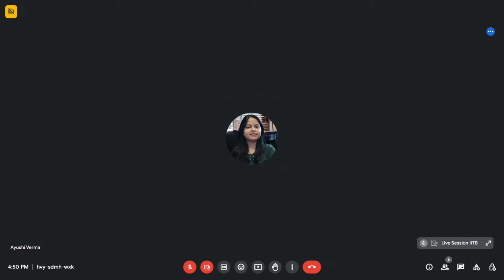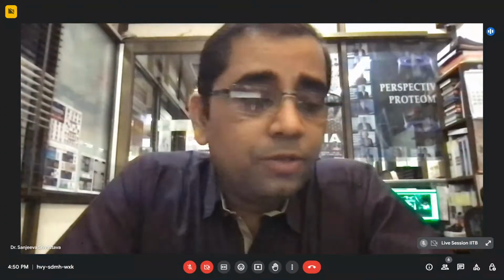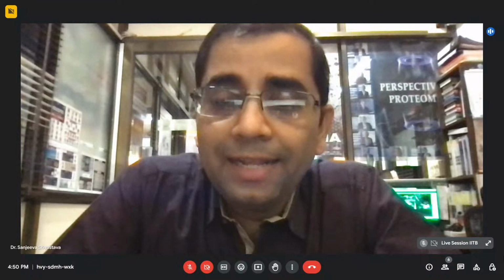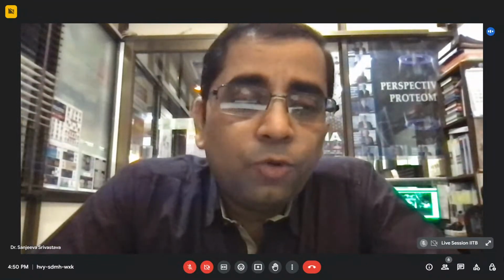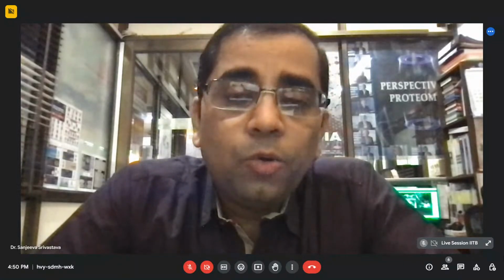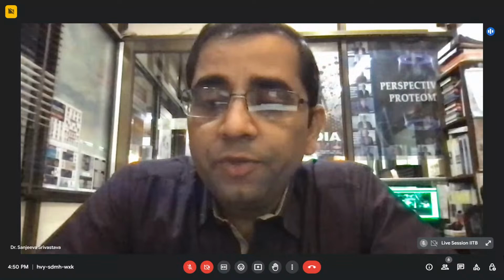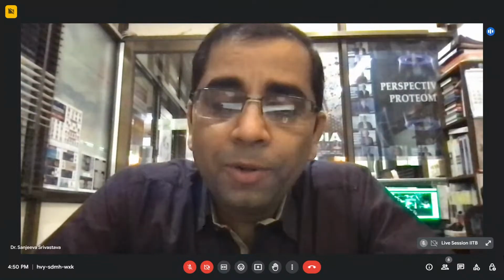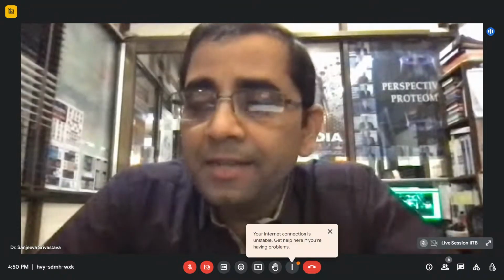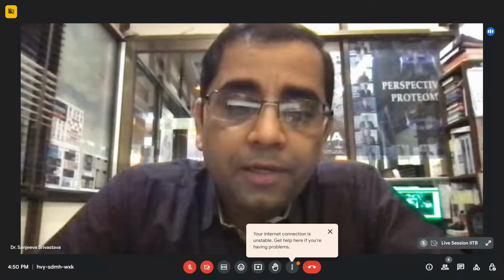Thank you, Tanvi. Again, what you see right now does not make any sense unless you analyze the data. That's where good databases and the data analysis workflow become important. What you have seen just now can only give you a visual, qualitative feel that the run has completed properly and the chromatogram looks good. The spectra look quite dense and the intensity is good. That's an indirect indication that your data should eventually come out good.